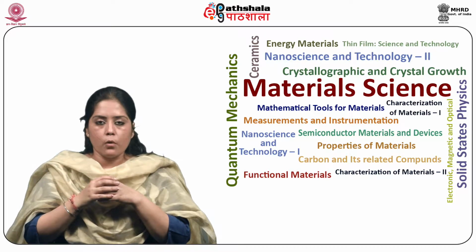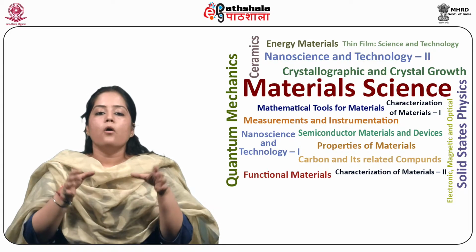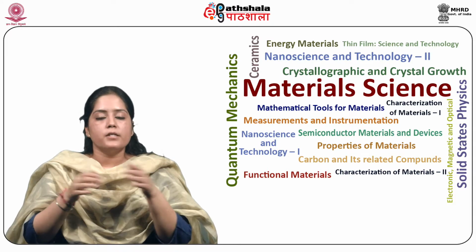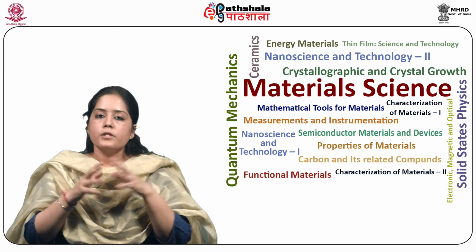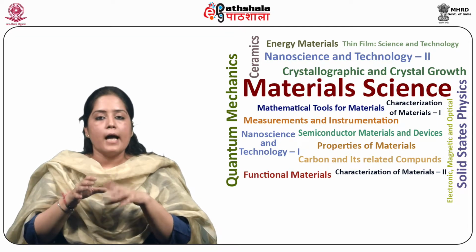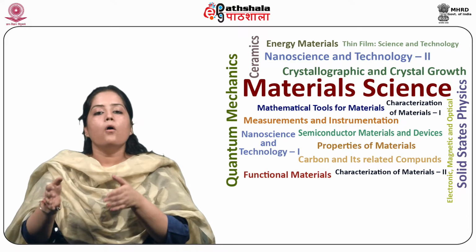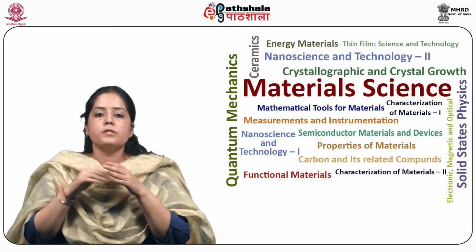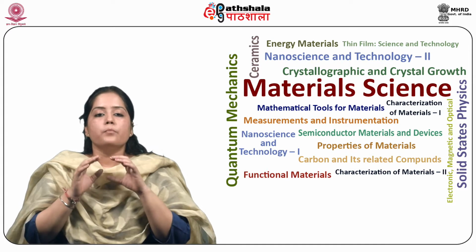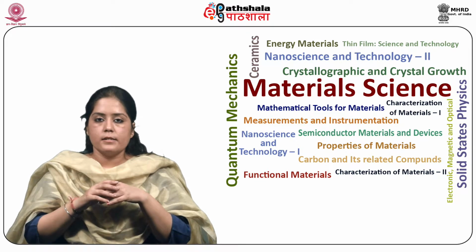Spectroscopy involves investigating the interaction of electromagnetic field with the matter. Spectroscopic data is represented as an emission spectrum of wavelength or frequency-dependent response. Spectroscopy can be broadly classified into two categories.